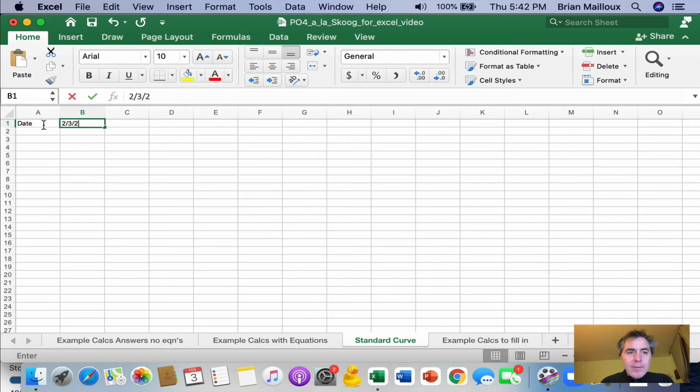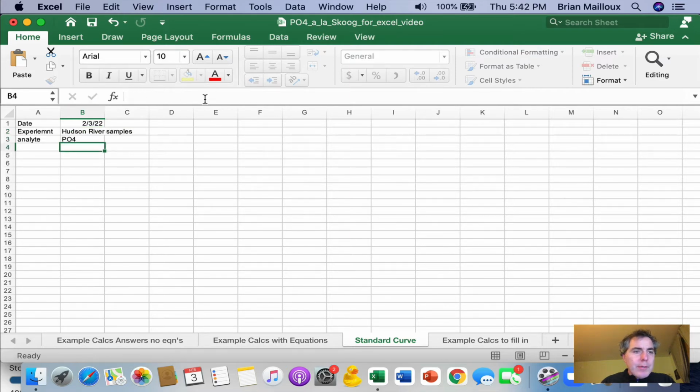So say we did an analysis today, then I put the name of my experiment, and I'm going to call it phosphate analysis. I would say the analyte, phosphate, PO4. I'll probably do something like Hudson River samples. Then I put the operator who's doing it. That's going to be me, in case someone else is doing the analyses.